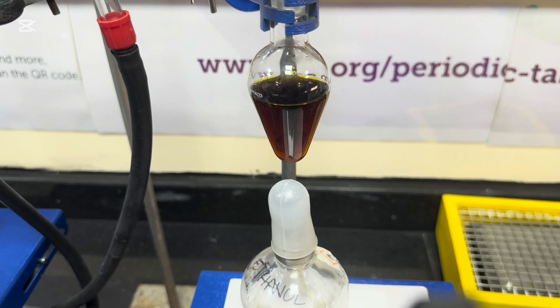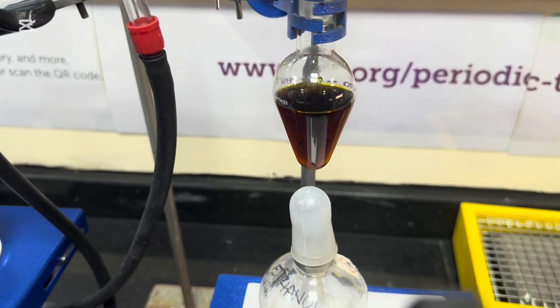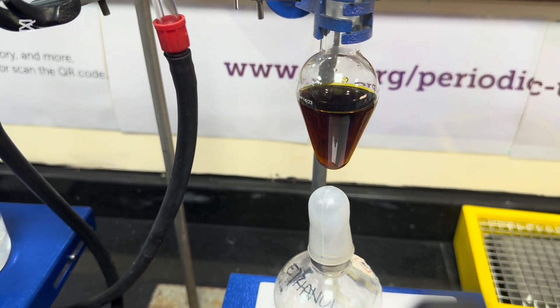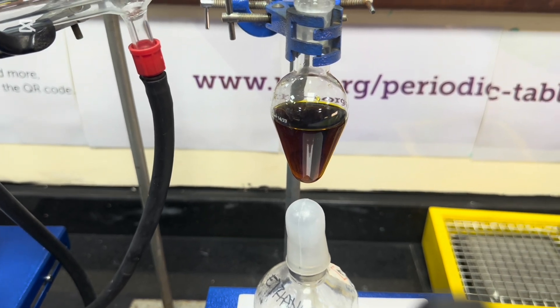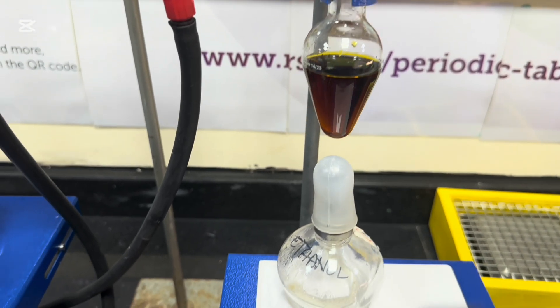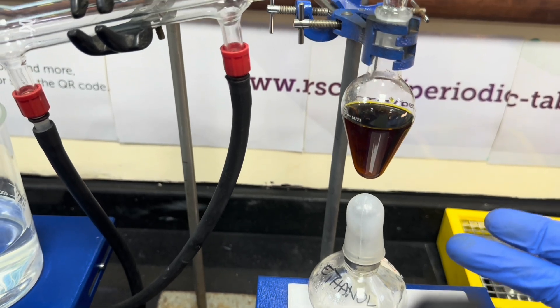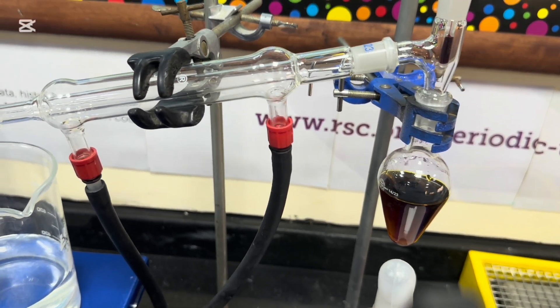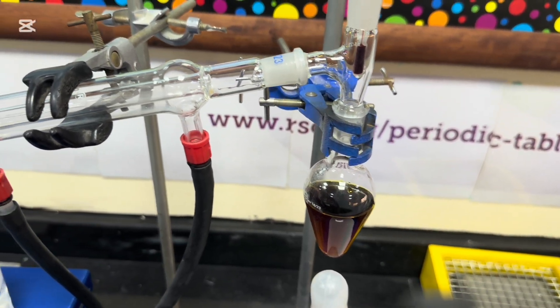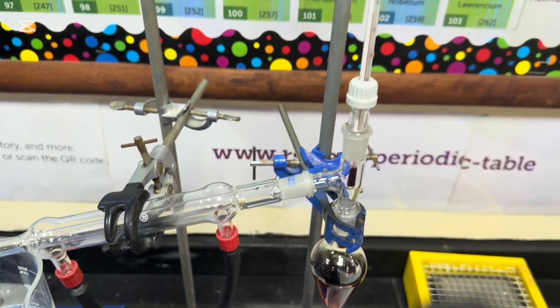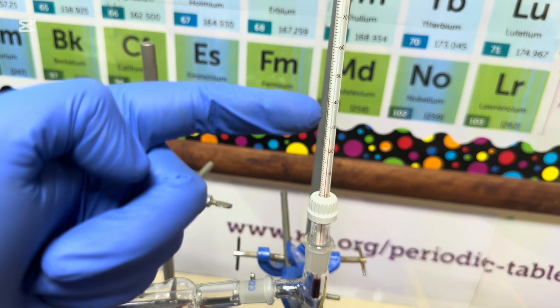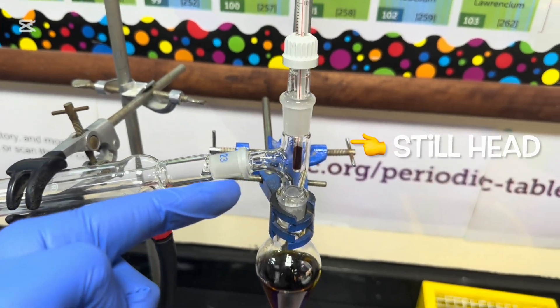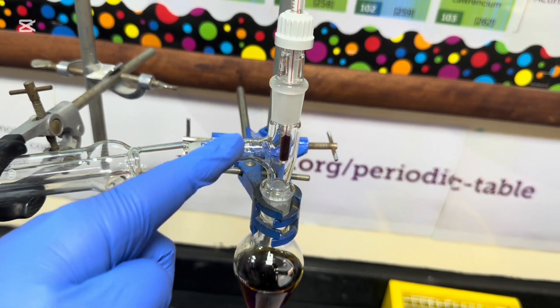So what I've now done is I've removed the ice water bath and I allowed the pear-shaped flask to warm to room temperature, which took around about 5 minutes. And what I'm now going to do is I'm going to light a burner underneath the flask and heat very gently with a small flame. Now this pear-shaped flask is connected to a still head, which has a thermometer connected to it. So I can measure any boiling point of the vapours that are condensing.